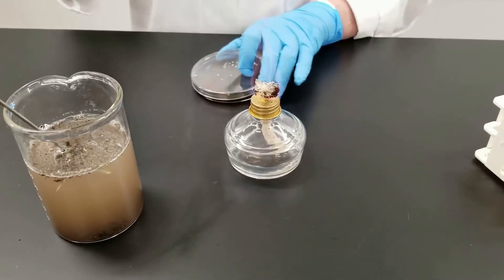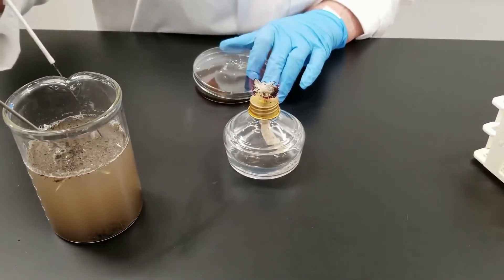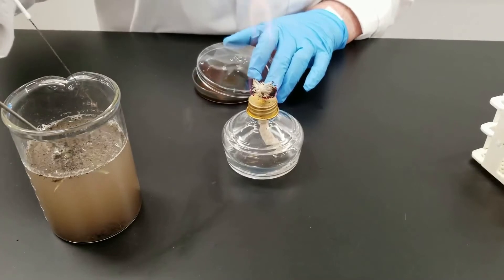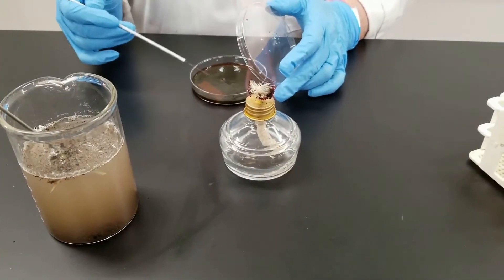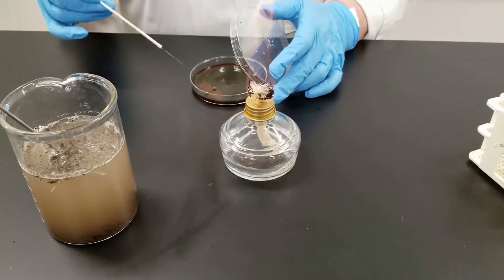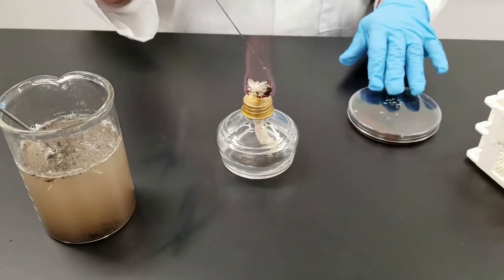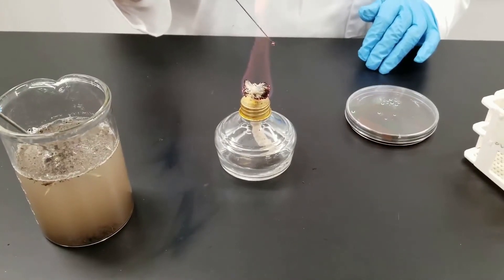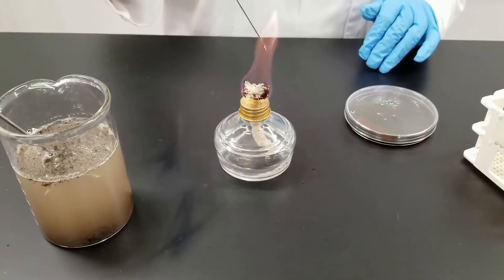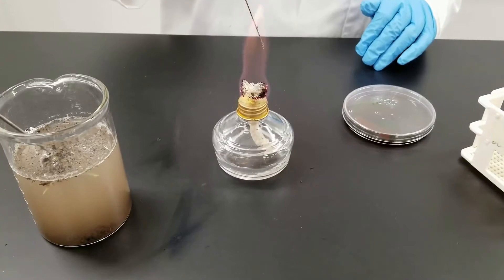For this we have an EMB plate, and I'm just going to take a sample of the water and streak it on the EMB plate to test for lactose fermenters. E. coli will grow as a very metallic green color. This will be incubated at 37°C for 24 hours. We're going to put it in the incubator, let it sit, and come back and check it.